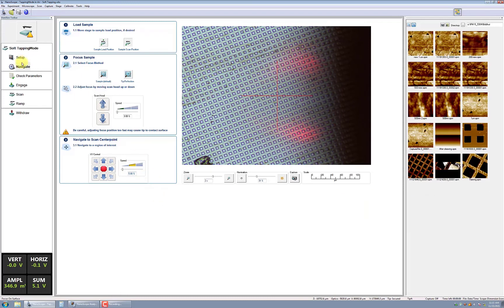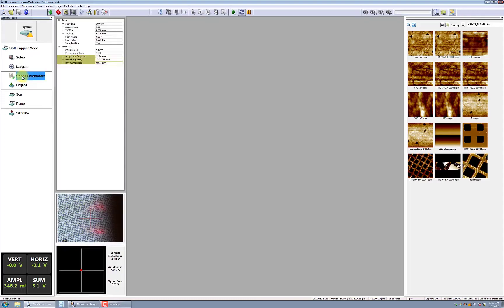Click Check Parameters from the Workflow Toolbar. Verify that the initial scan parameters match those shown in the SOP.